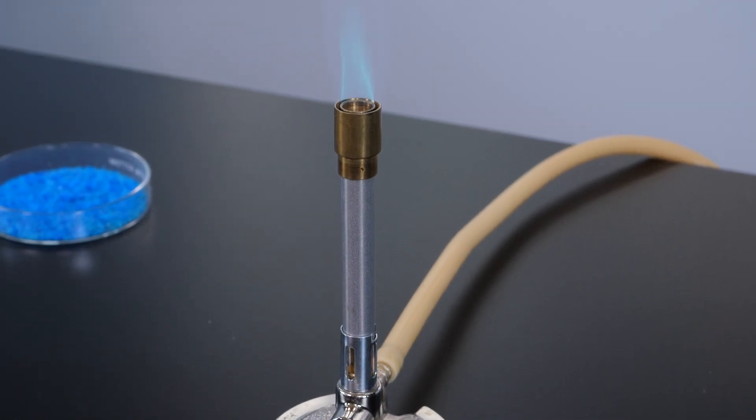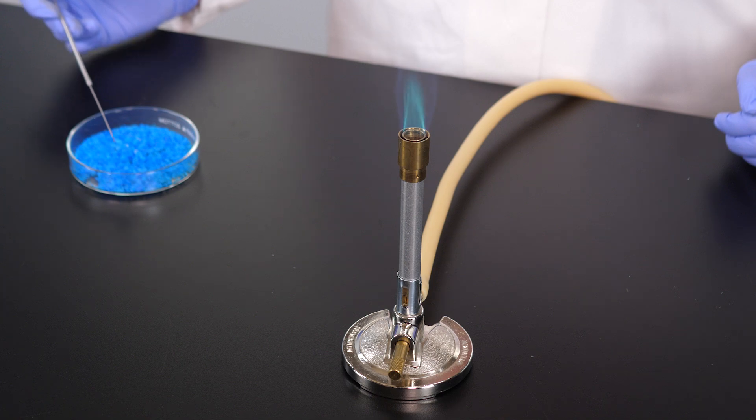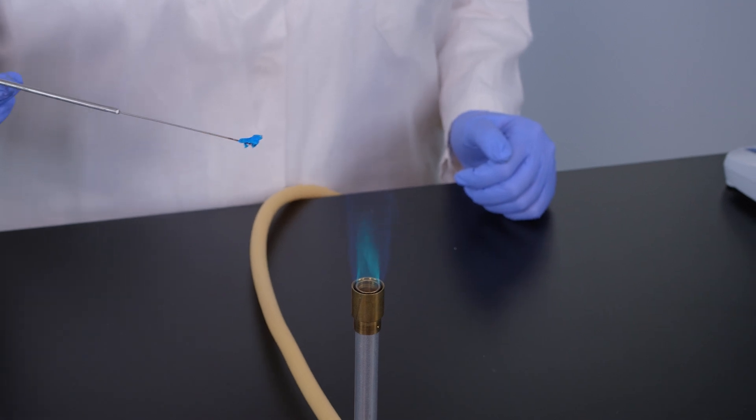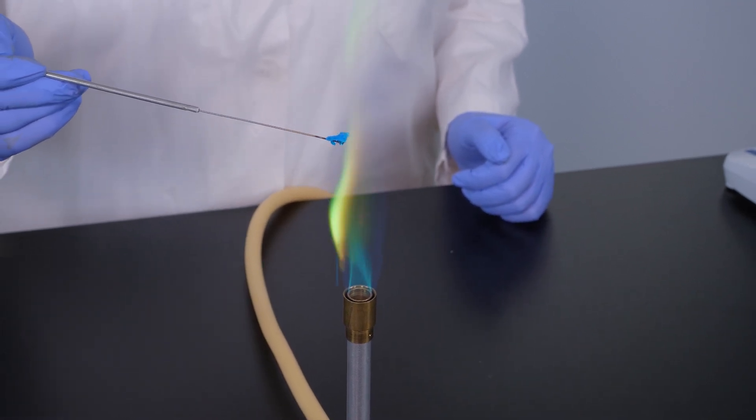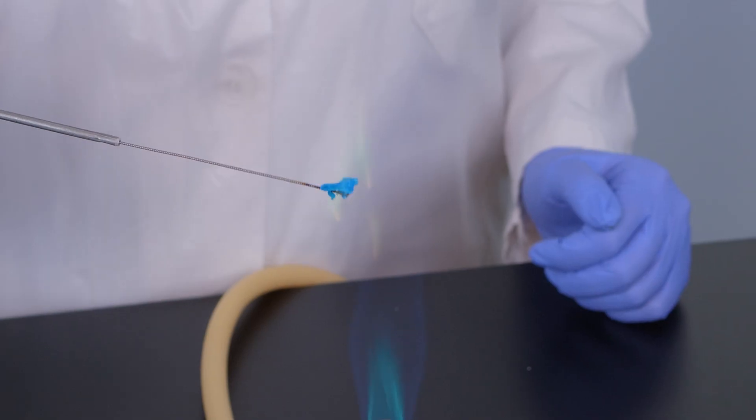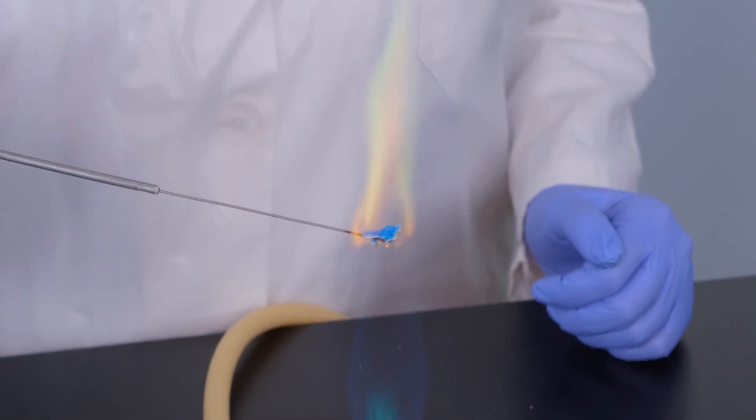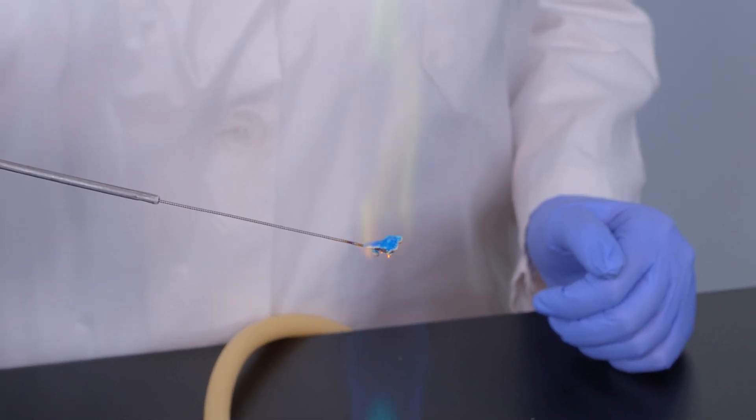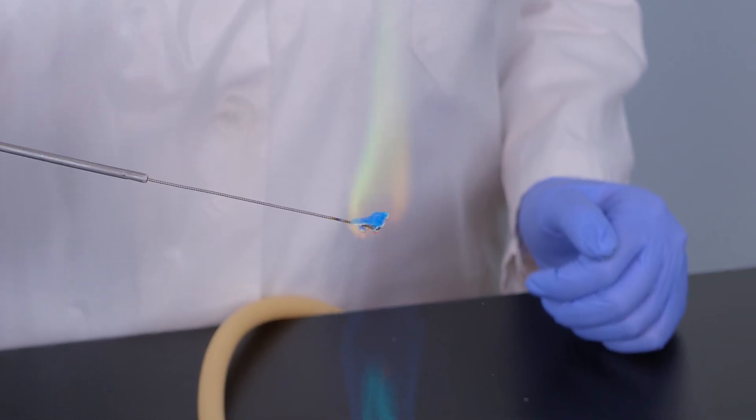Let's begin with a flame test. To conduct a flame test, we hold a crystal of the substance in the flame of the Bunsen burner. According to our data, when copper sulfate pentahydrate is added to the flame, the flame should burn with a green-yellow color. As we can see, the flame turns a green-yellow color. This test alone is not sufficient to prove the unknown substance is copper sulfate pentahydrate, because other substances also cause a flame to turn a similar color.